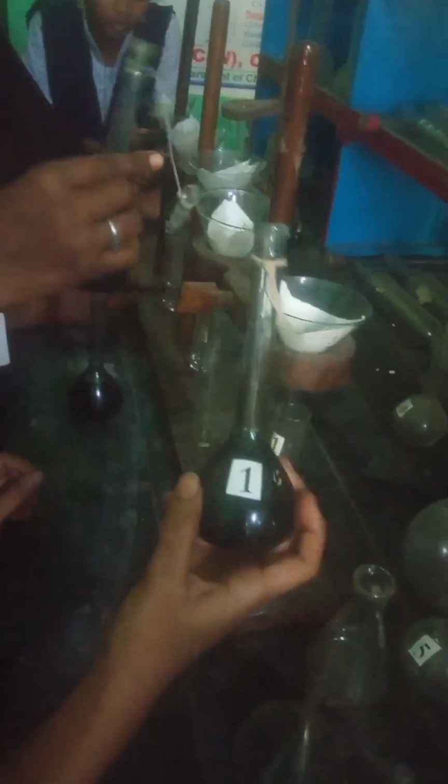Now the students are doing that. The filtration is going on.